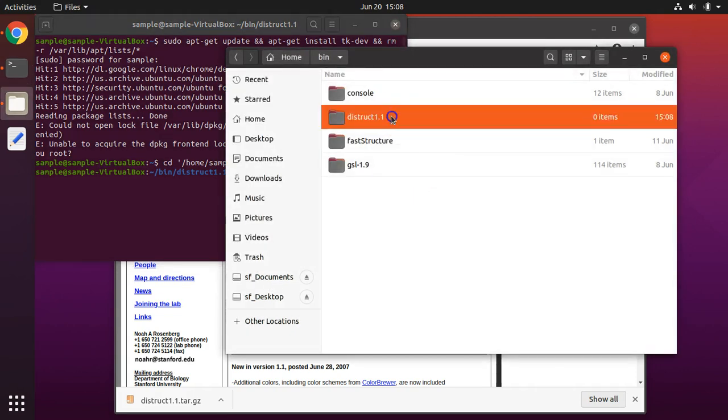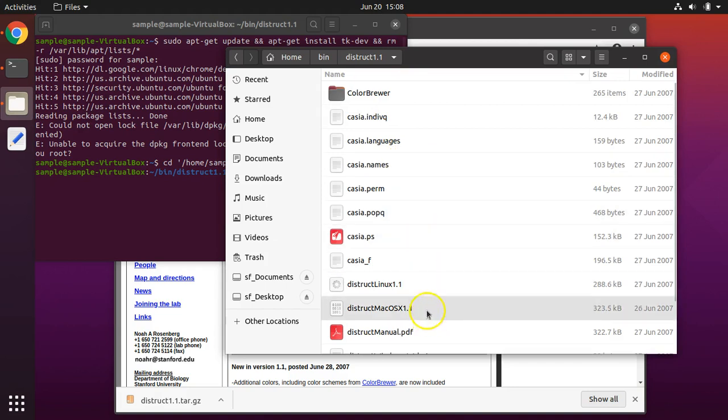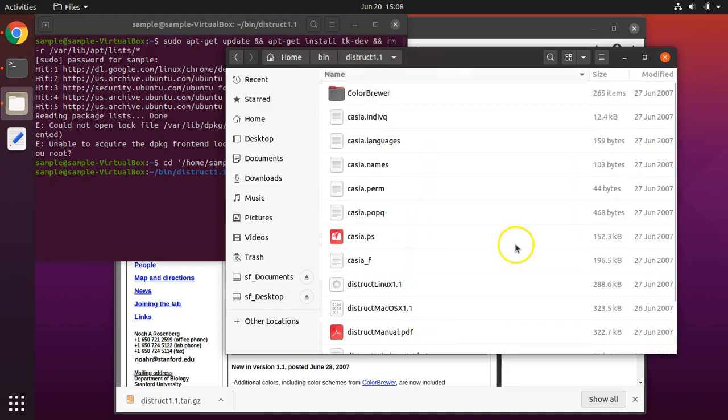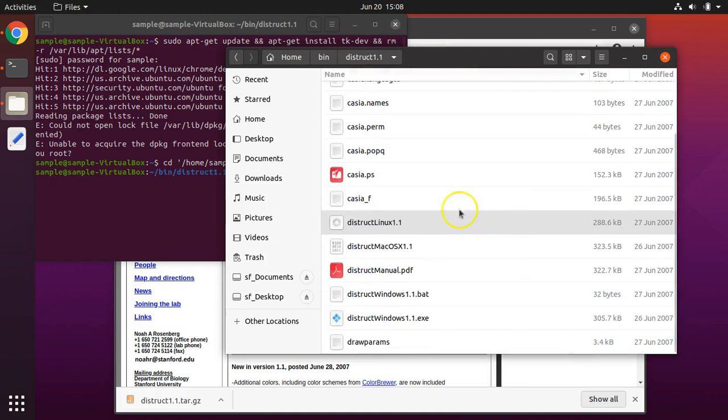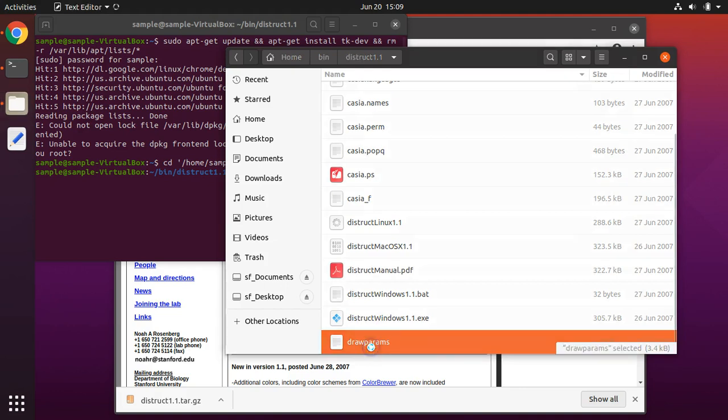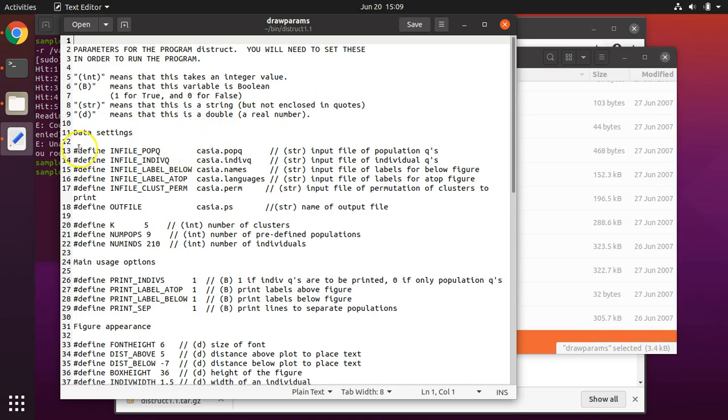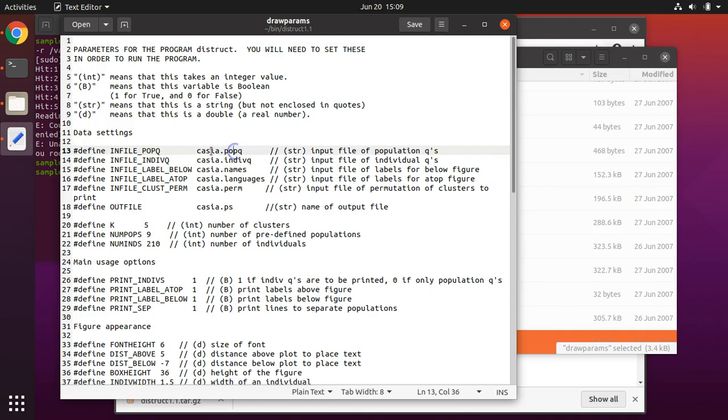When we need to run DISTRUCT, any files that we want to visualize need to be within that DISTRUCT folder. Furthermore, we need to set this file called draw params. Double-clicking on it will open it up in your text editor.